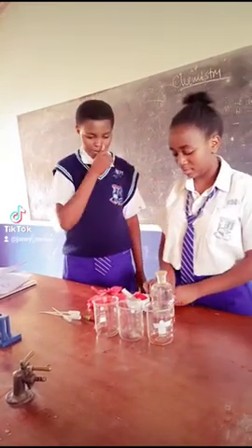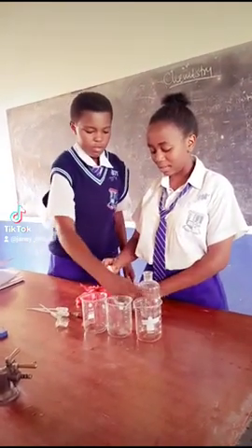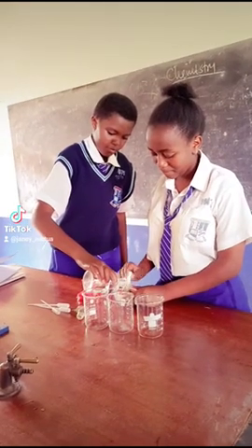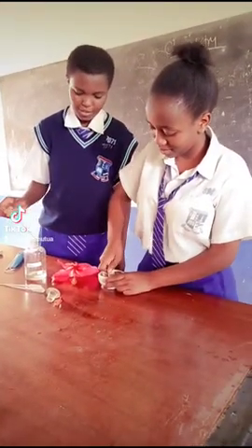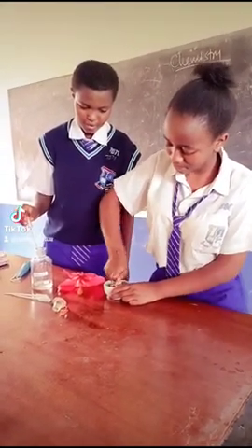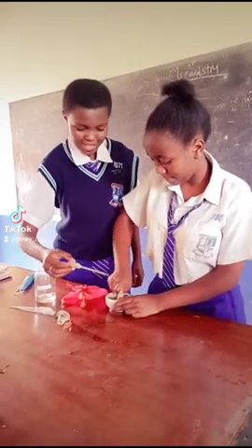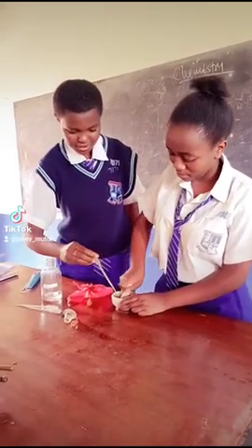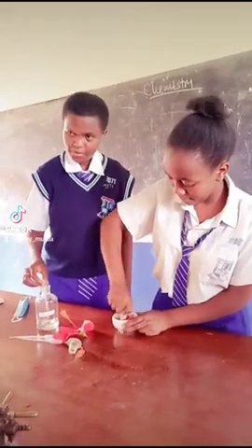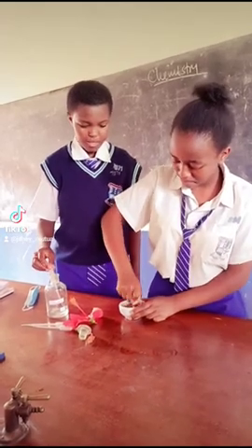So the first step, we are going to crush the flower petals as we are adding ethanol. So as she continues to crush, I continue to add some ethanol. Our flower extract is almost ready.